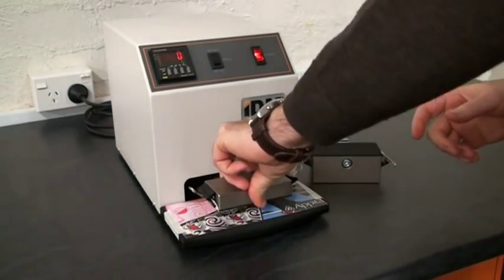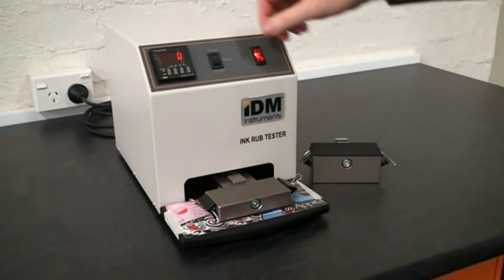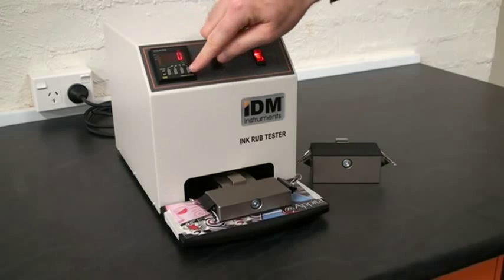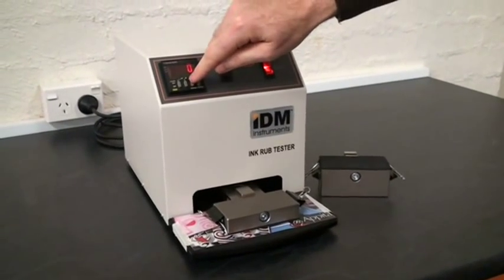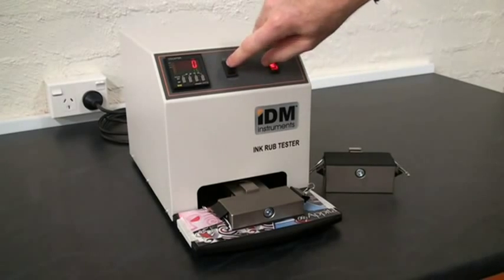Hook our weight over the arm, and we select the desired amount of rubs. In this instance, we're going to select 15 — so I'll select 1 and 5 and press star.